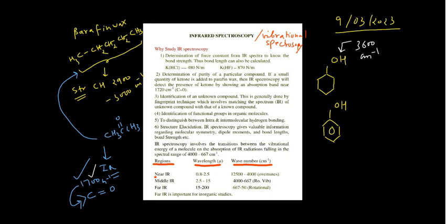And also at the right top corner the link is flashing. You can click on that link to go through this particular lecture also. Okay, so this wavelength can very easily be converted into the wave number, and if the range is 0.8 to 2.5, then you can easily convert this into 12,500 to 4,000 centimeter inverse. And this region is important for the overtone bands.